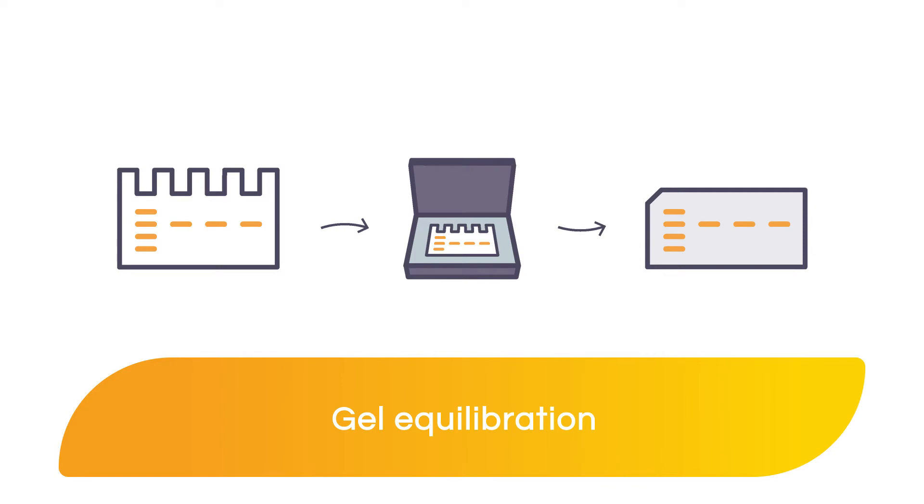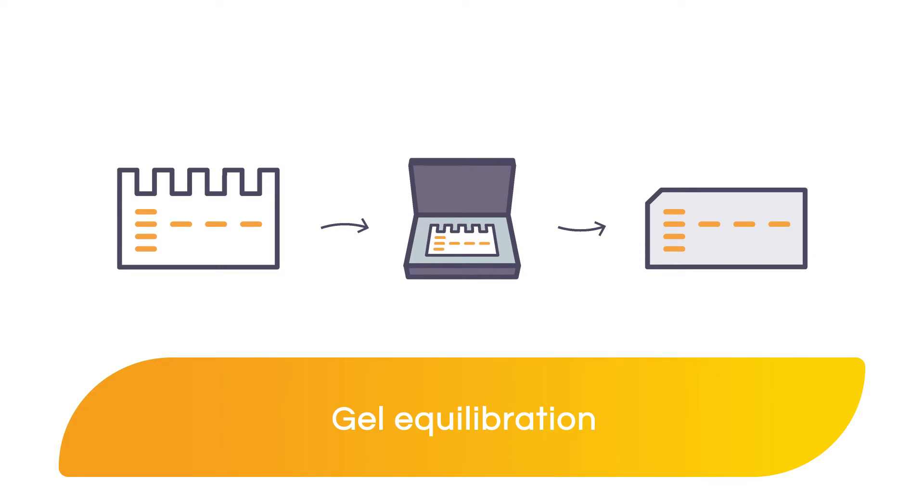After running the gel, the first step is to equilibrate the gel in transfer buffer. Gel equilibration is a commonly overlooked step. In this step, we will prepare the gel for assembly in the transfer stack. I know we're all in a big hurry, but taking the time to prepare the gel made a big difference in the success and quality of my Western blots when I was in the lab.